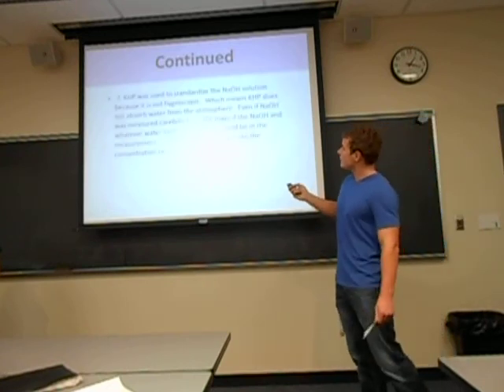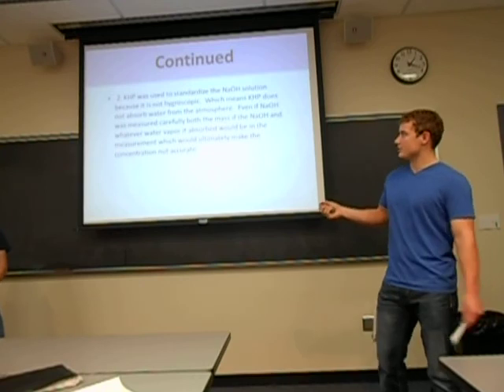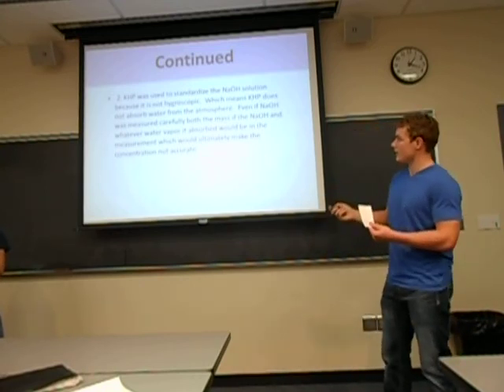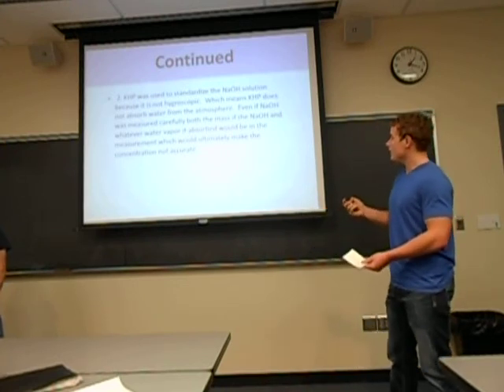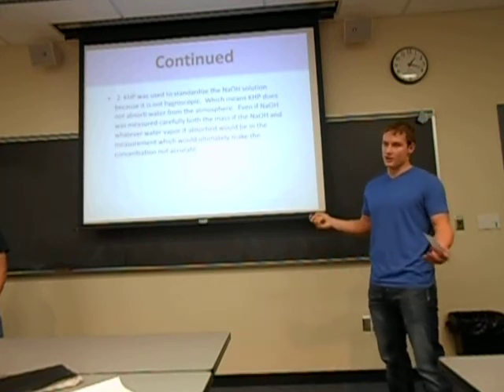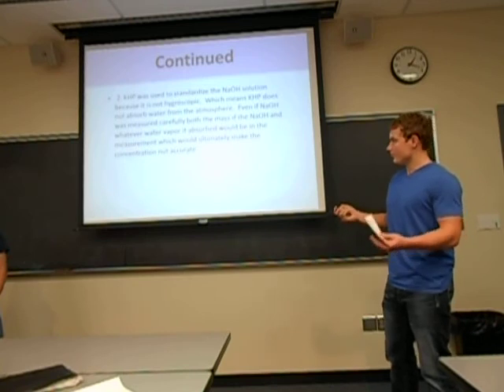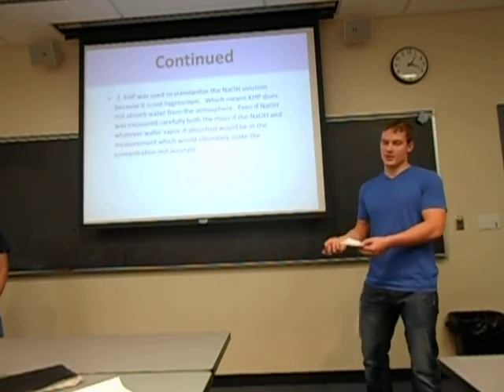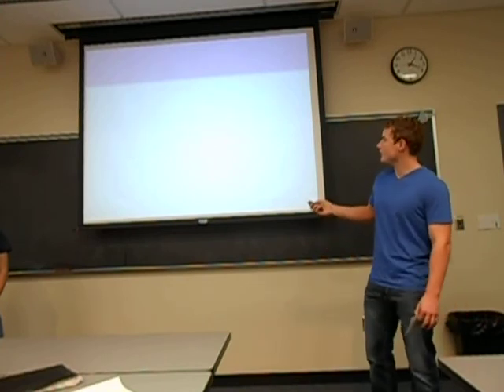Our second question was, why do we use KHP to standardize the sodium hydroxide solution? It was because KHP does not absorb water from the atmosphere, whereas NaOH does. Even if the NaOH was measured carefully, it's still going to absorb water from the atmosphere. The measurement would make the concentration inaccurate because of the change in mass from the time you measured it to the time you actually used it in your experiment.